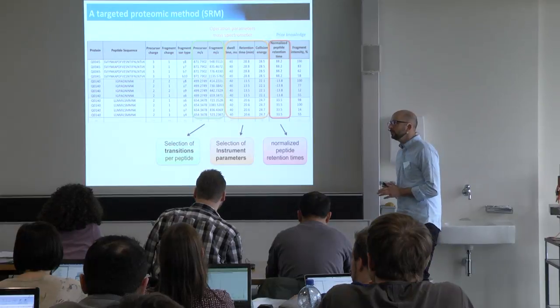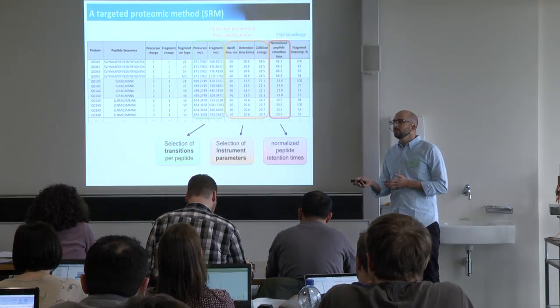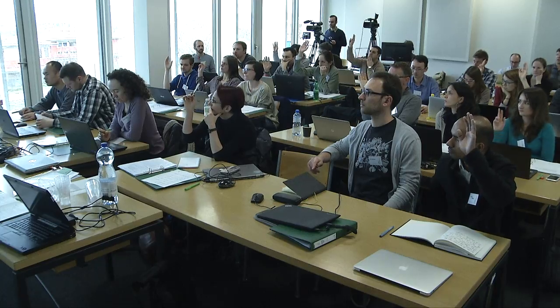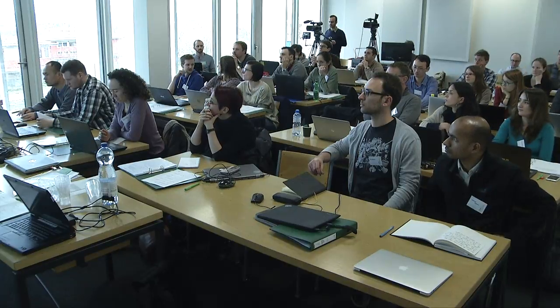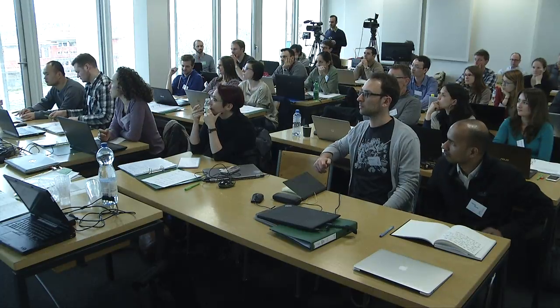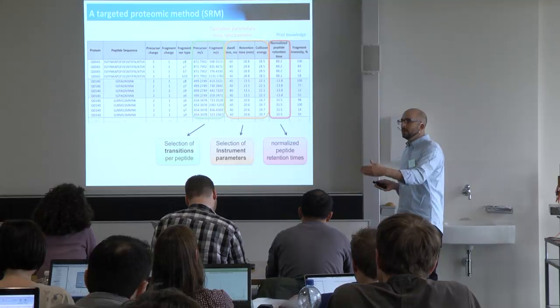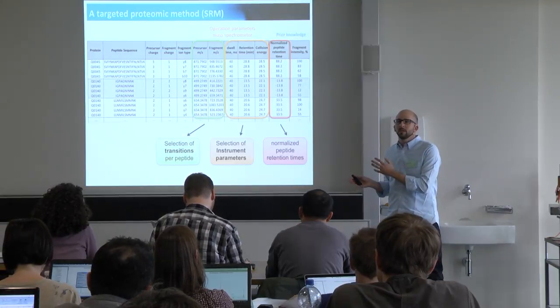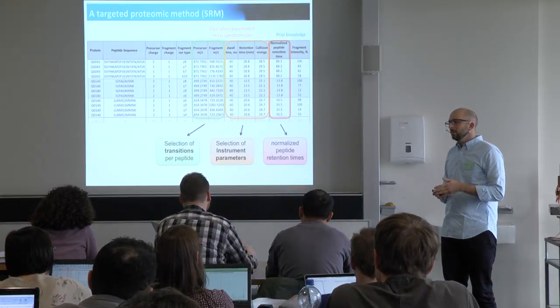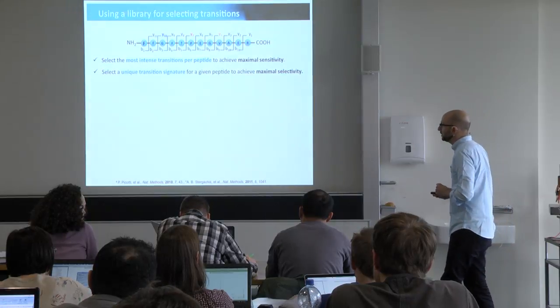Just a question before I start. How many people are working or interested in working with triple quadrupoles or SRM? Okay. And how many people are interested in doing PRM? Okay. Most of the slides I'm going to be presenting are related to SRM, and we'll get to PRM during the week. Some of the principles apply equally to PRM, and I'll try to highlight where this is the case. But please note that some of the things are specific to SRM, and I'll try to mention this.